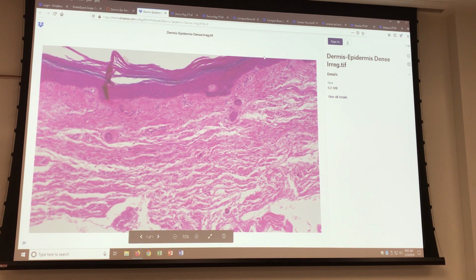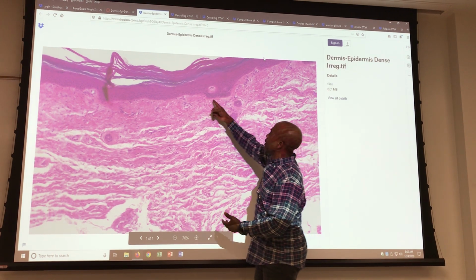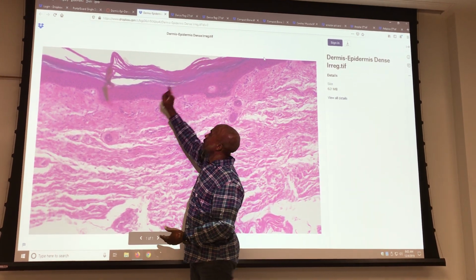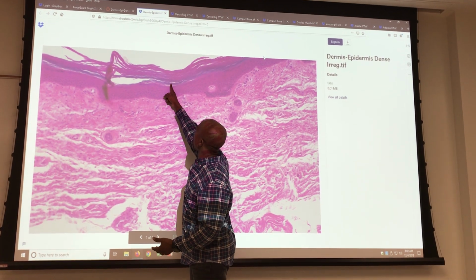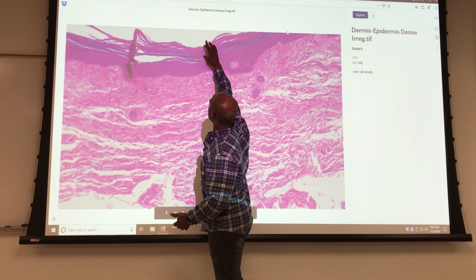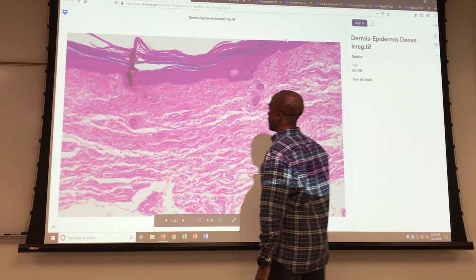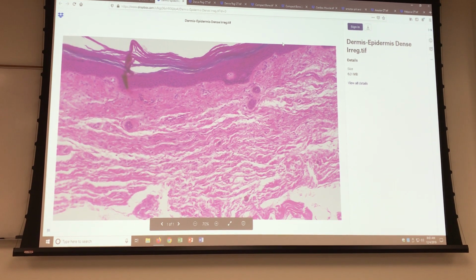And up top, this is the skin as well. So this part is dermis. This part here is epidermis. All of the dark areas? Yes, with your basale, spinosum, granulosum up here, lucidum, and then corneum. No lucidum here because this is thin skin.